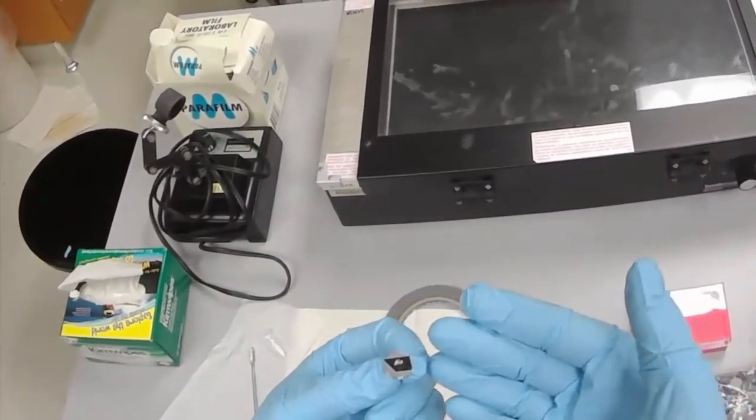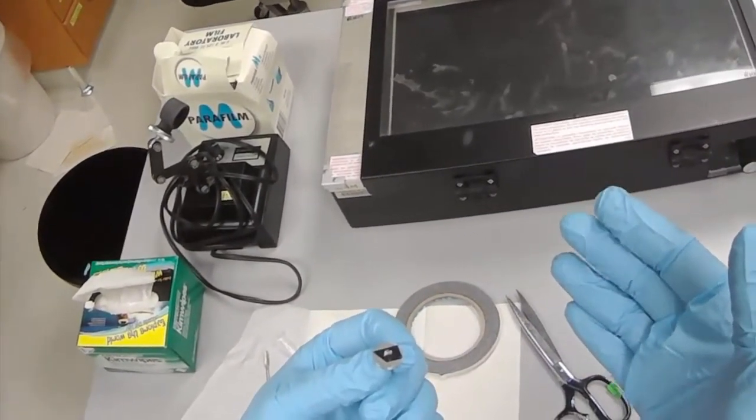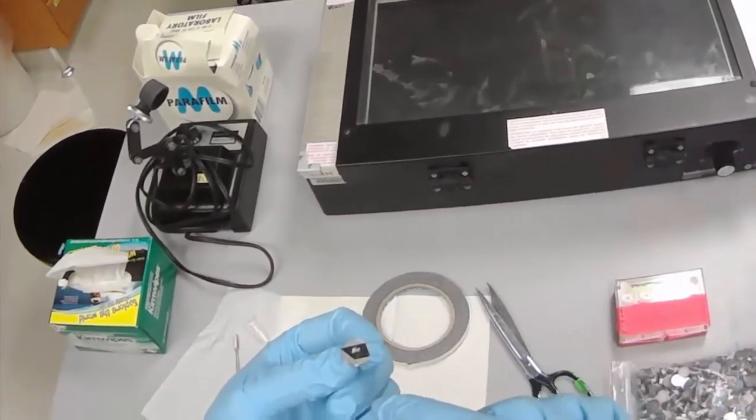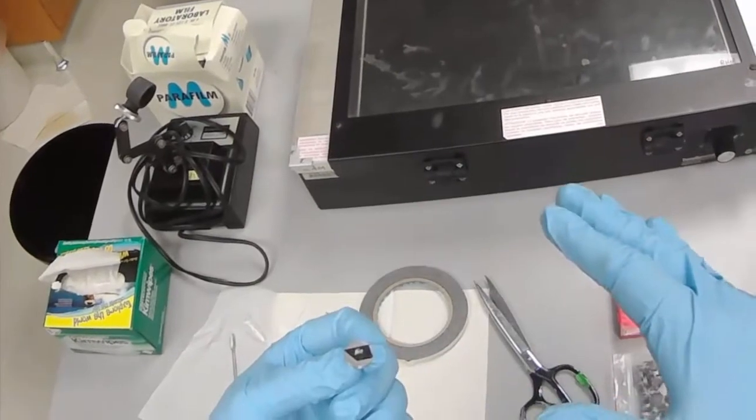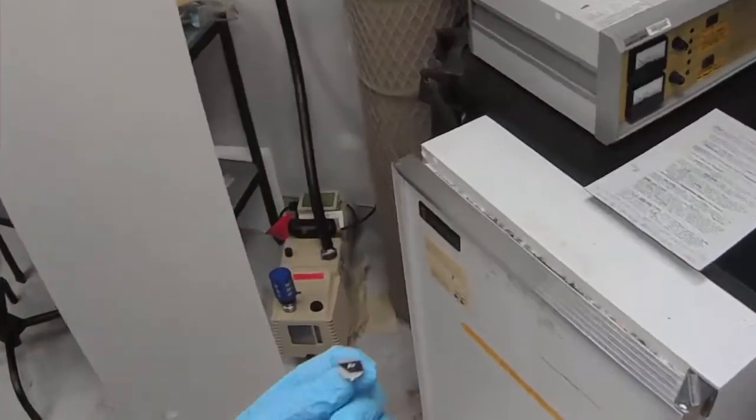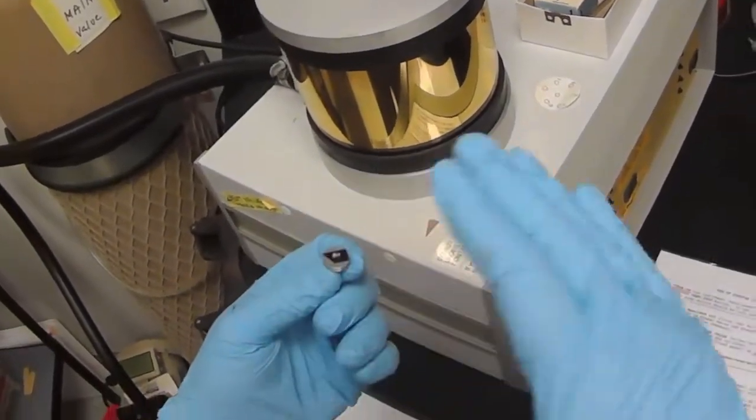Now our sample is a polymer, a non-conducting polymer. In the electron beam, it will experience static charges and blow apart. So to make this sample conductive, we're going to coat it with a thin layer of gold. The idea is we want a layer that's so thin that it will not change the shape.